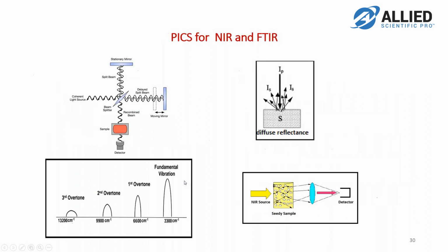the absorption. So you can see how diffuse reflectance, where there is scattering, the reflectance from the surface and maybe a little bit beneath the surface is causing the signal to come up. And this method, which is interferometric, is very different. This is usually used in the mid IR, for fundamental vibrations, while near IR uses overtones.